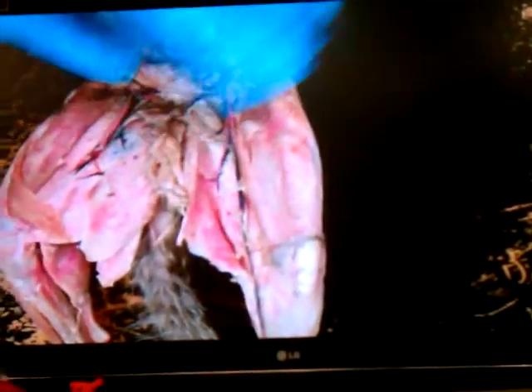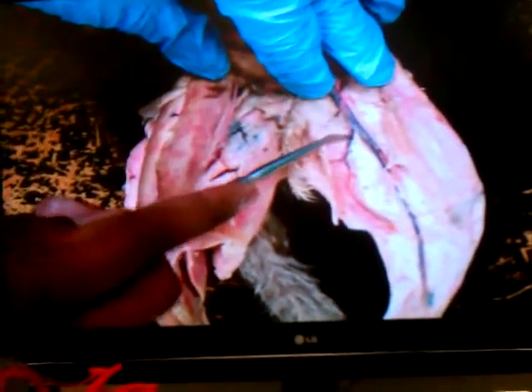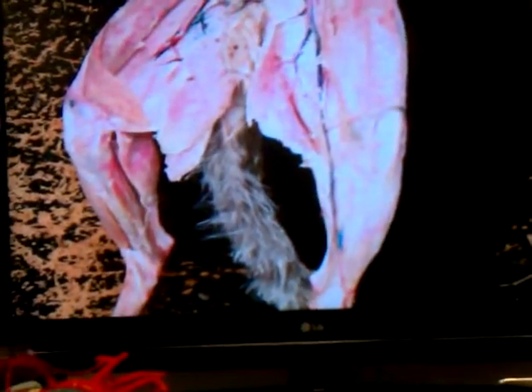And I'm going to move to another place. What is this vein right here, Mr. Gilmore? Deep femoral. That's deep femoral. Then what makes this vein? Saphenous. That's pretty much all the ones that I'll put on the test. If I'm behind the knee, you know it's got to be popliteal. But the location tells you where the vein is. That's the vein. It's really straightforward.